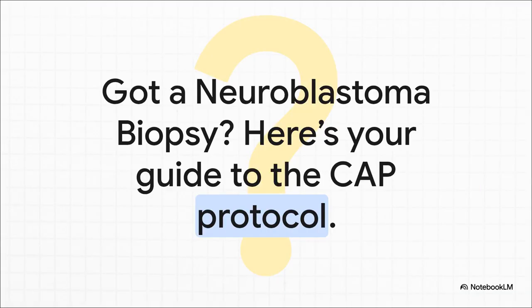Picture this. You get a small blue cell tumor biopsy from a kid. Neuroblastoma is screaming at the top of your differential. So, what now? Well, this guide is your roadmap. We're going to walk through everything, from the gross bench all the way to that final synoptic report, hitting every single key decision point you need to know.